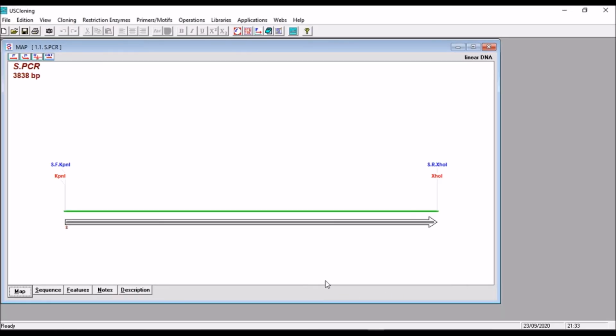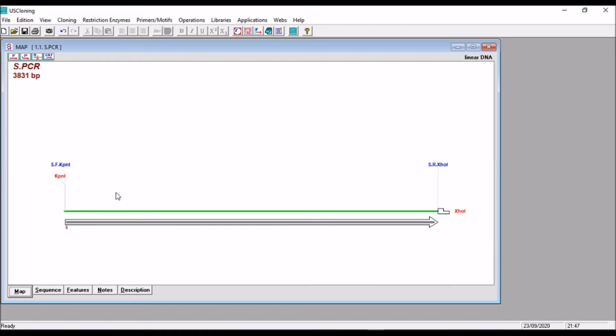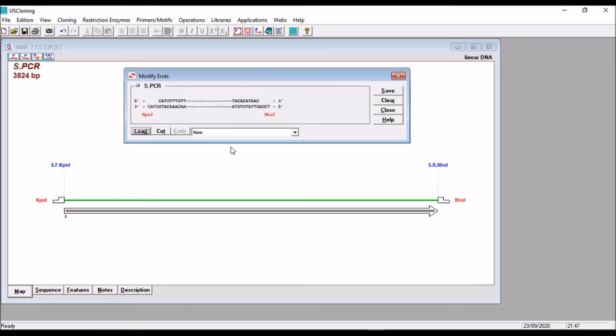Okay, here it is. To prepare the gene for the ligation, you have now to digest with the enzymes here and here. Now you've got your insert prepared for ligation. See that the PCR construct contains 2 sticky ends for KpnI and for XhoI here. Here are XhoI.